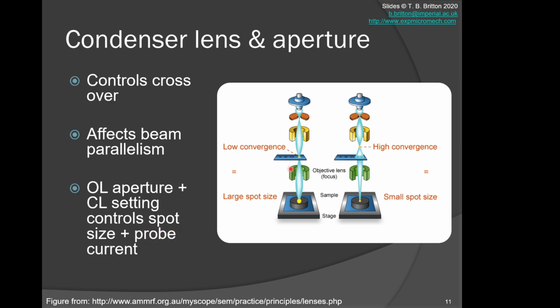And depending on the microscope manufacturer, they will name this two different things in the system. And some microscopes, Zeiss instruments, for instance, will just have a setting that will deflect the beam through the different apertures. JEOL instruments, for instance, or FEI instruments, they'll actually physically change the aperture by moving it through the system in these cases. But fundamentally, this broadly, it changes the spot size and it changes the probe current of our system.